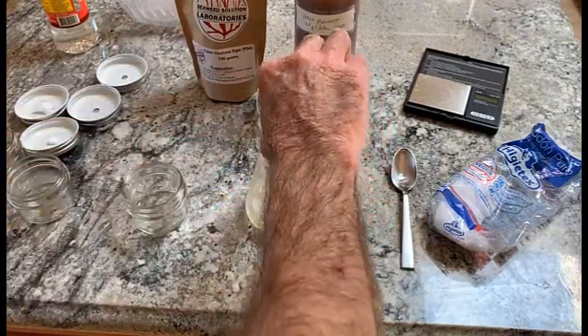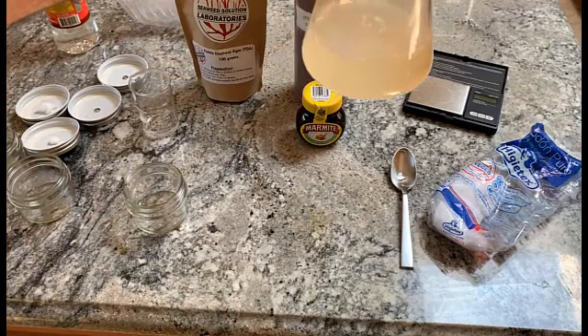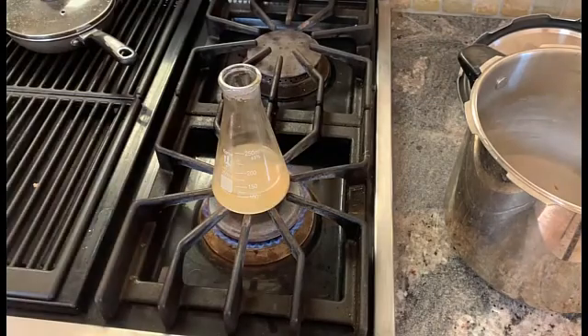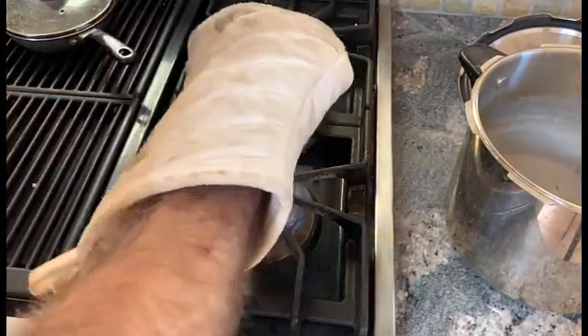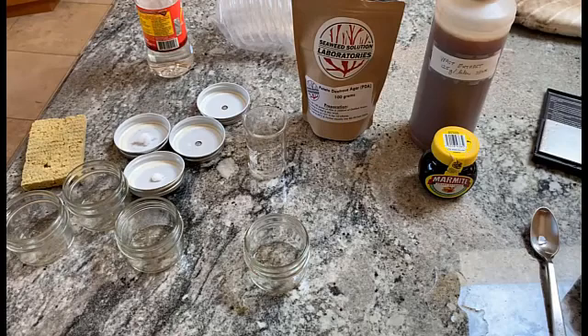We bring the water up to 100 milliliters and then we have to boil this to dissolve the agar. A better way to do this would be to use a hot plate, but this works — we're not too fussy. While that's coming to a boil I'll show you the way I like to make plates.